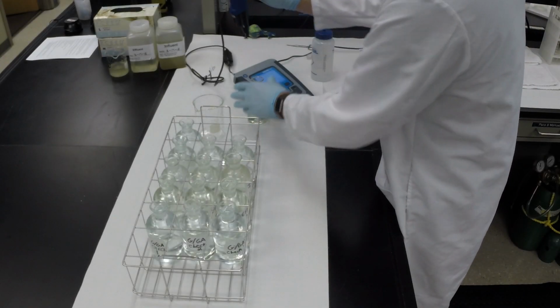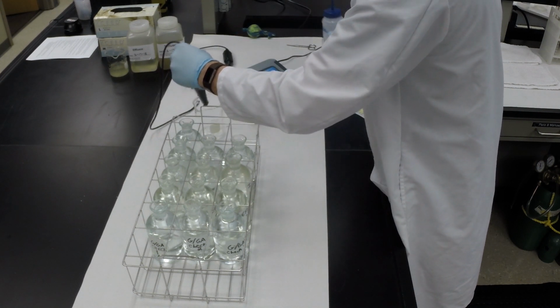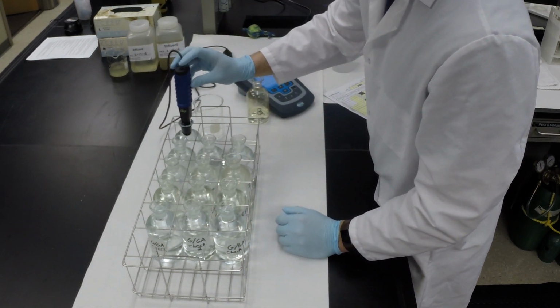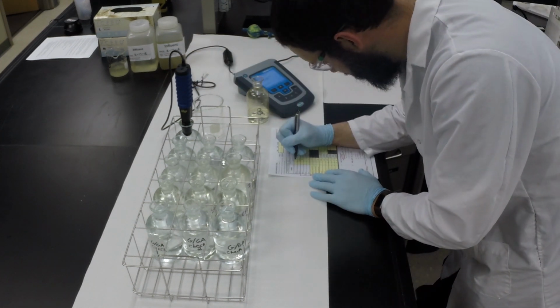Remove the probe from its holding bottle and gently rinse it using DI water. Gently but firmly place the probe in the first blank bottle. Turn on the stirrer and hit the read button on the probe. Allow the probe to stabilize. Once it has stabilized, record the initial DO reading on your bench sheet or LIMS. Remove the probe and rinse it with DI water.